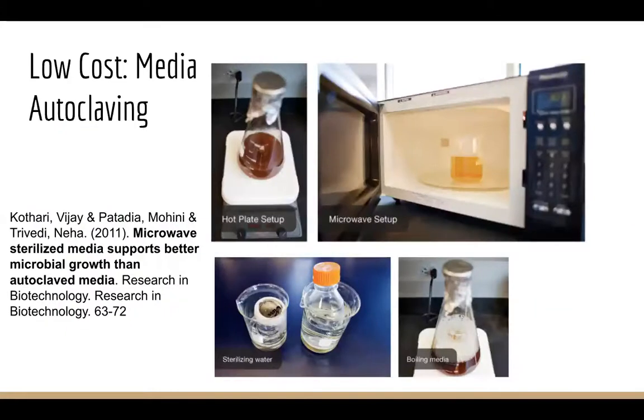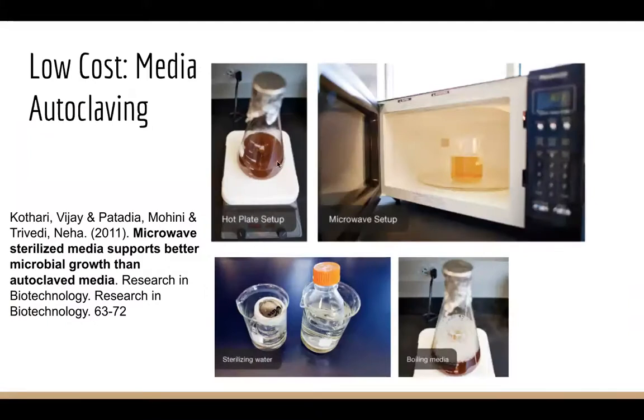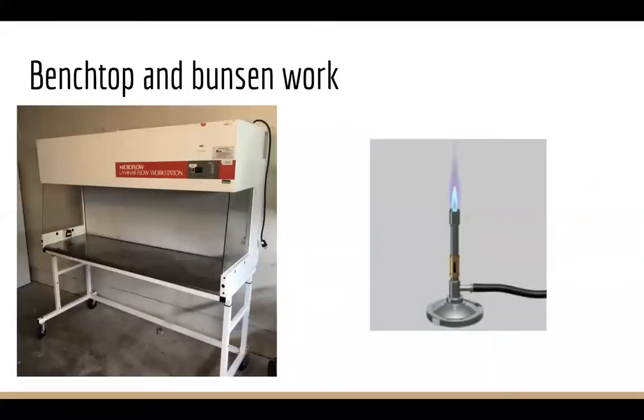And so if, for example, all you had was a hot plate setup or a microwave and a Bunsen burner, in fact, you can do quite a lot of work, because you've got your sterile conditions, you've managed to create using this sort of umbrella of sterile area, as well as a sterile media starting dish, and that way you can do quite a lot of work, especially when you've got the flame to sterilize any metal equipment that you might use, for example, for moving discs across, or for using ethanol to sterilize a glass rod or glass inoculator, for example.